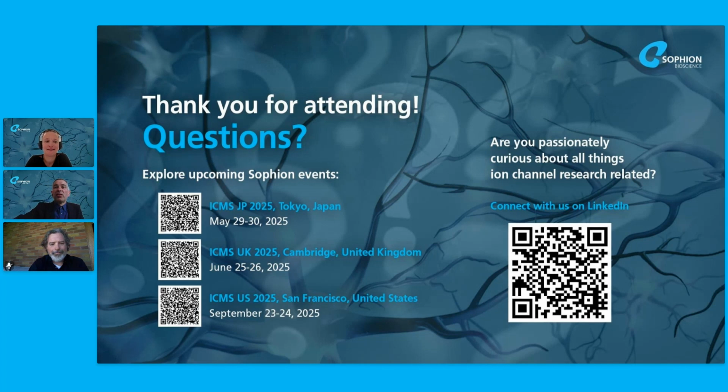Thank you. Kinda. And then another one for you, Kadla, which is one of the questions I skipped to take Chris's while we were on that success criteria style question. So Adele asks, have you tested iPSC-derived sensory neurons for mechanosensitive or nociceptive ion channels? I don't think that we have. We have an ongoing project with red blood cells where we test for mechanosensitive ion channels, but with the iPSC-derived neurons, I don't think so.